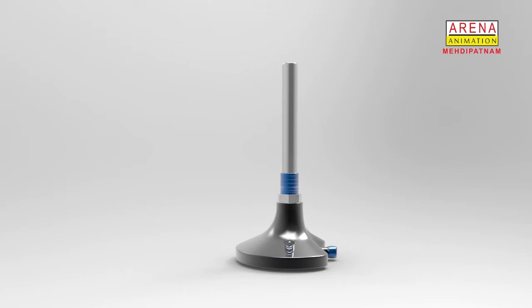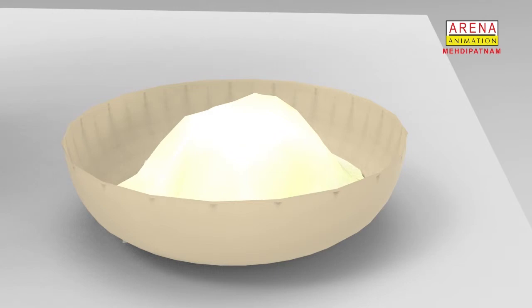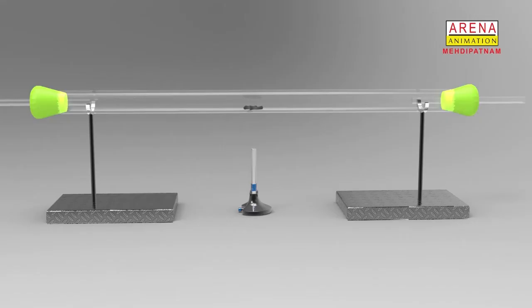burner and black copper oxide. Procedure: take 2 stands and place them as shown in the video. Fix the glass tube in the stand. Now take 1 gram of black copper oxide and place it in the glass tube.